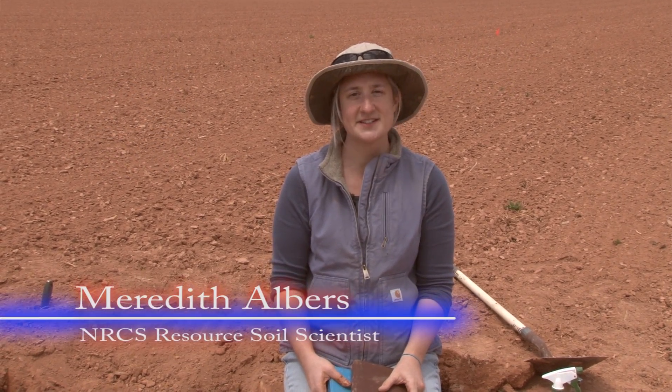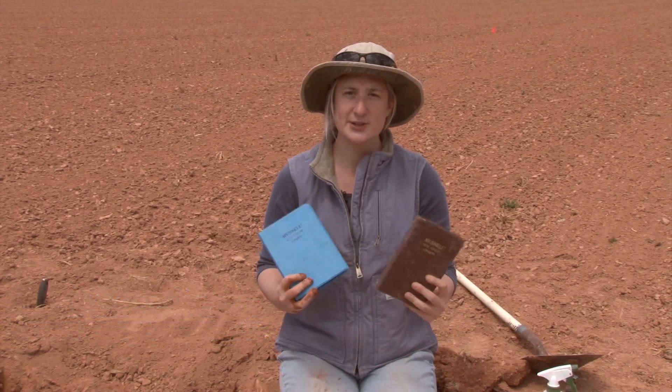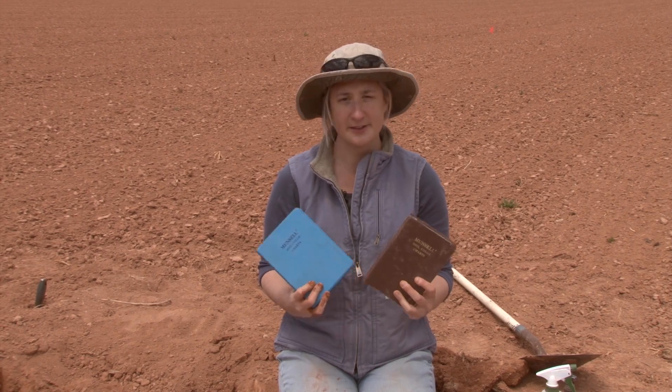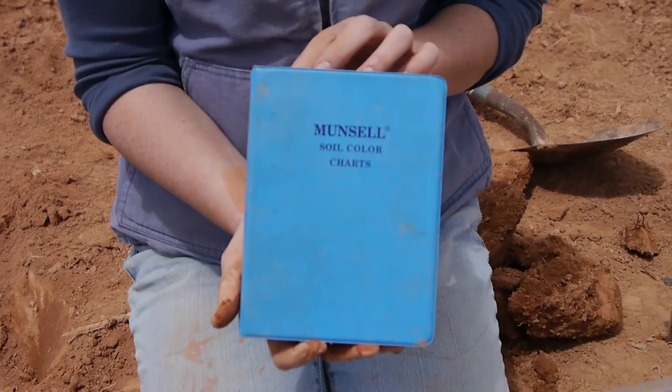For your Envirothon test you're going to need to determine the color of your soil material. These are two different versions of the Munsell color book. They're both just as good — they're just different generations — but we're going to use the blue one today.